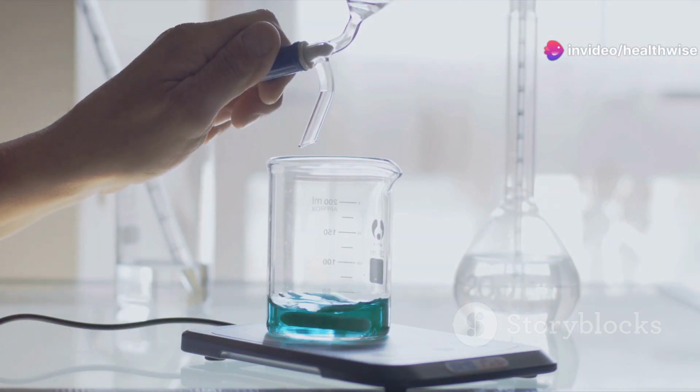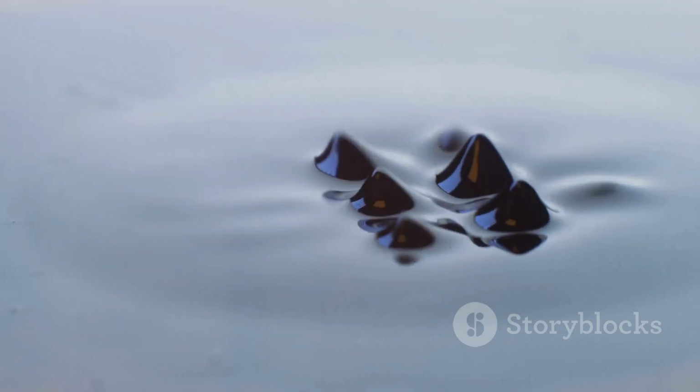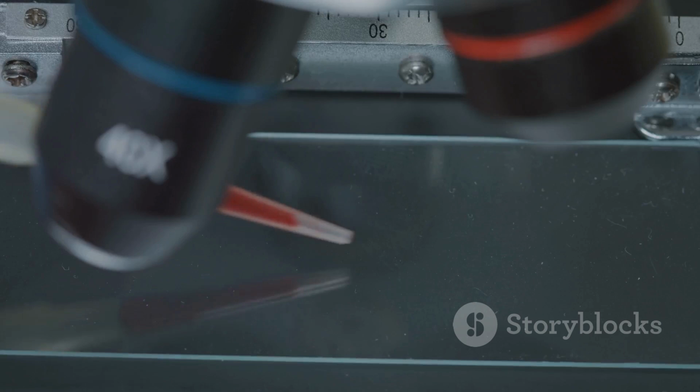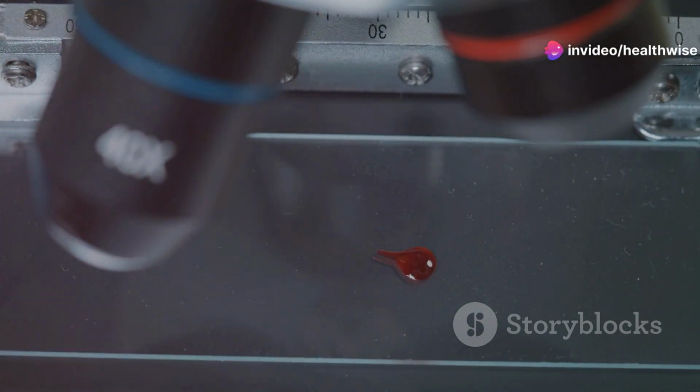First up, let's explore ion exchange chromatography. Picture this. You have a tube packed with a special resin. Think of this resin like a bunch of tiny magnets. As our mixture of molecules travels through the tube, some are attracted to the resin due to electrostatic forces.